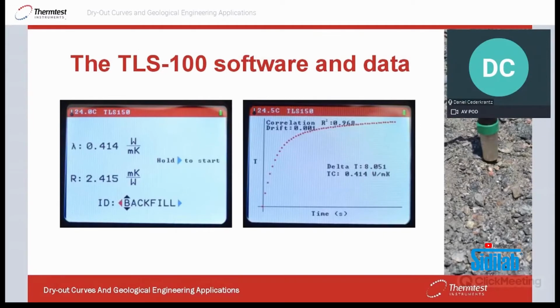Basically, how well does our result line up with a linear plot? So we want to have a number as close as possible to 1 here for a good result. It also tells you the drift, which is important to know. This is the temperature drift. You don't want the sample temperature to vary when you test, but we will have a few more words on that.